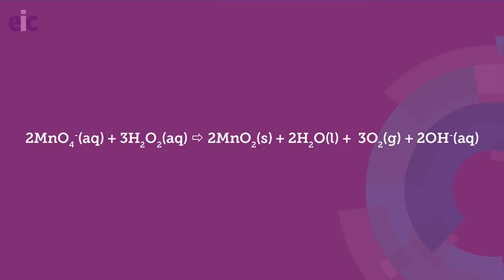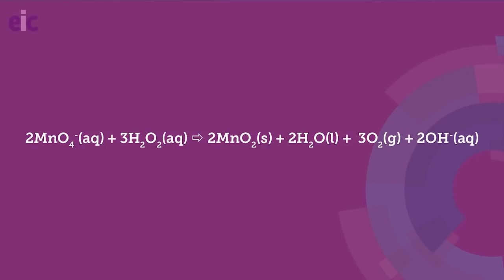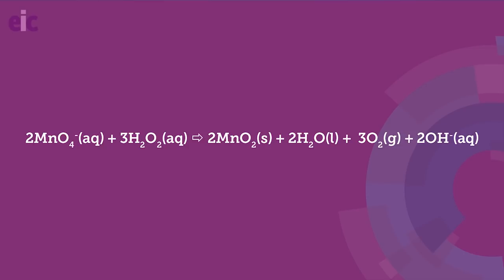After it's been added to the mixture, the potassium permanganate reacts with the hydrogen peroxide to release oxygen, which accelerates the burning of the ethanol. This produces the bangs and flashes and pops that we're actually seeing during the reaction. Different crystal sizes of permanganate can affect the size and the frequency of the flashes and pops that you're getting.